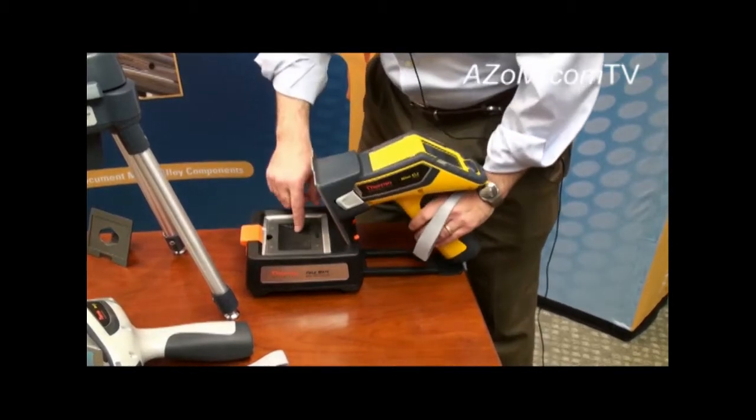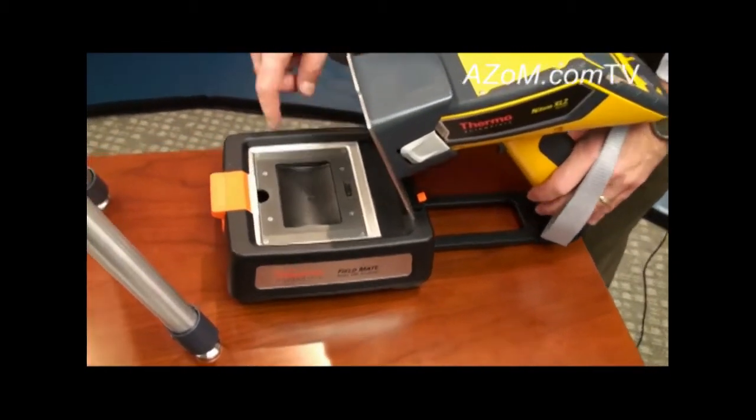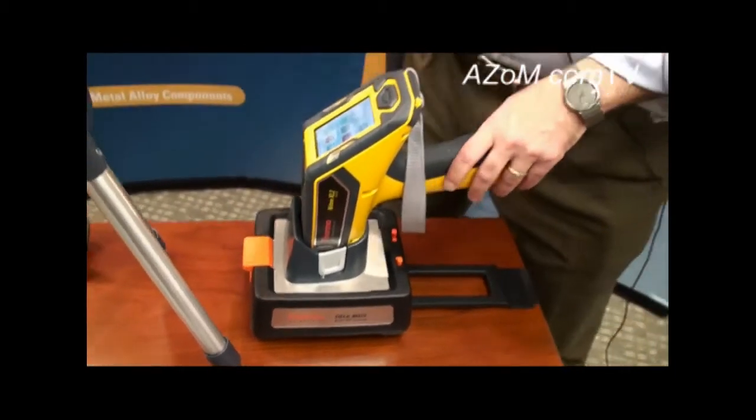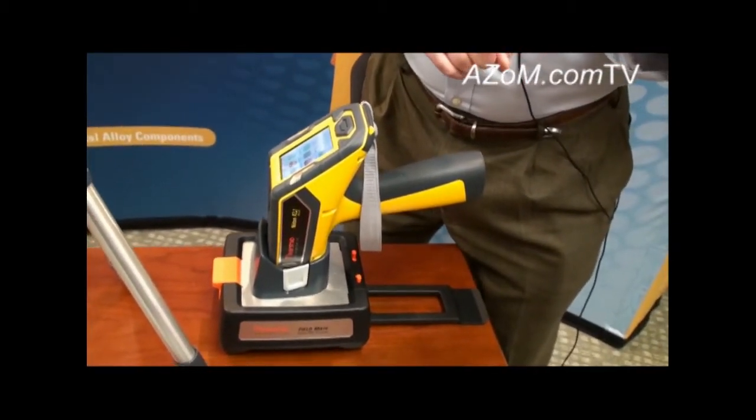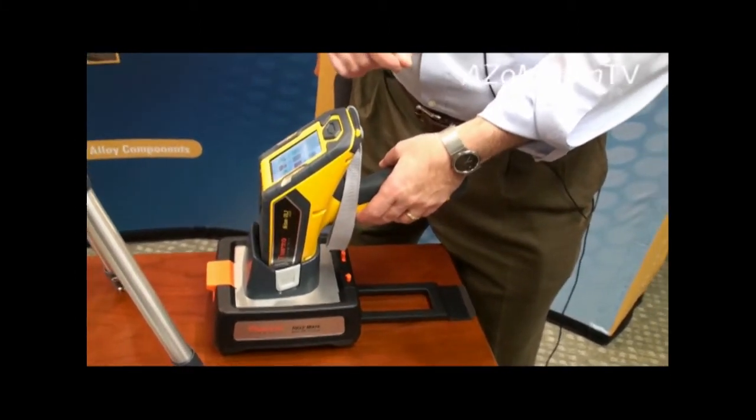You can just pop the sample — in this case a bagged sample — into the test stand. You close it up and you can set the instrument to run one or two minute measurements without having to hold on to the trigger during the duration of the measurement.